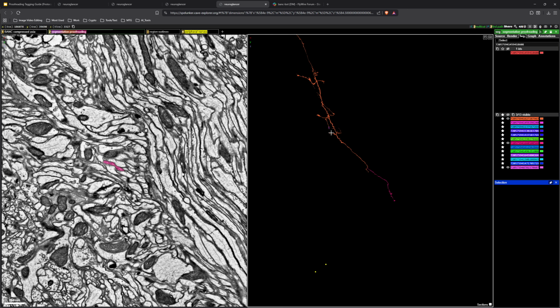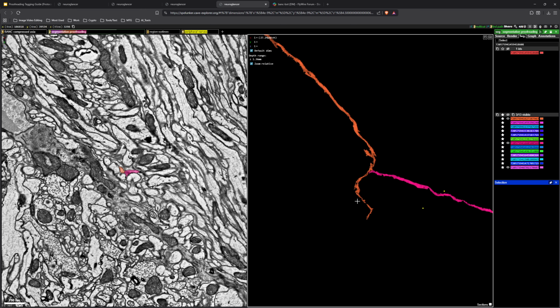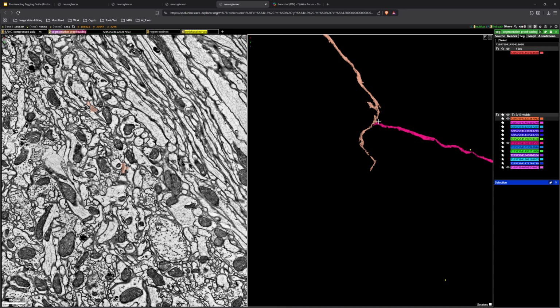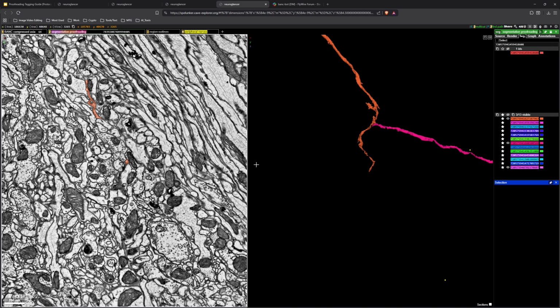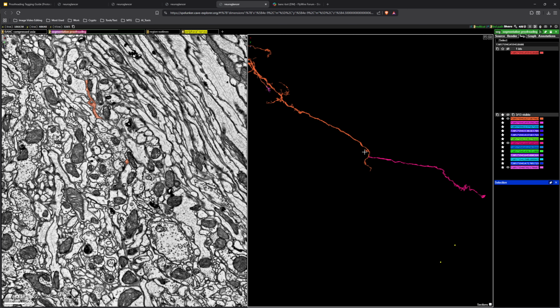But that's just the layer in which a lot of these visual optic lobe neurons tend to synapse. Believing with our hypothesis that it's a TMY cell, as I found this connection, I first tried to make the cell go this way. But when you look at it, the cell's main backbone wouldn't go this way, right? Because all those other cells, none of them did that. They all sort of had a branch that did this and then mostly continued that way, right?